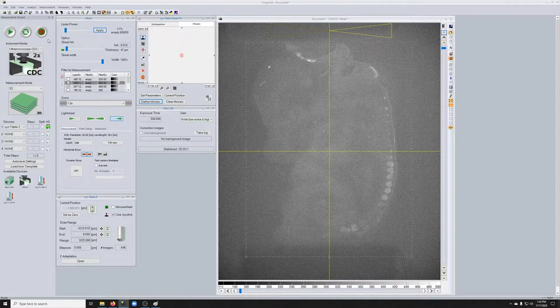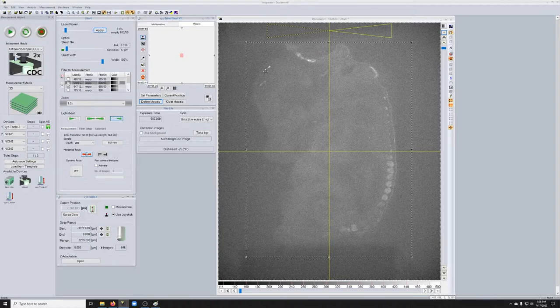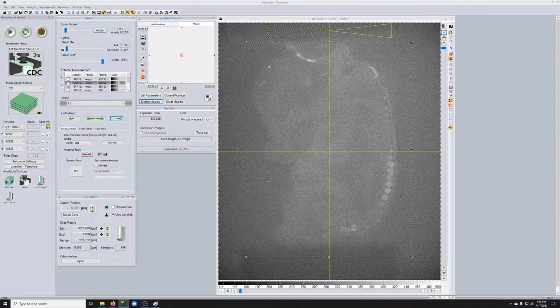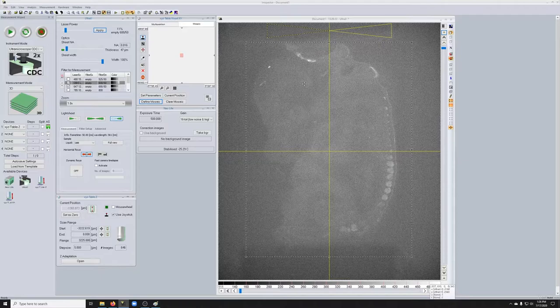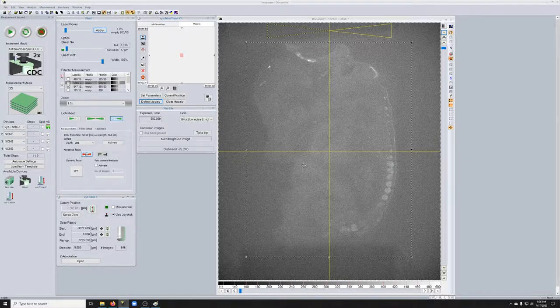Okay, so that concludes what I wanted to tell you about for cropping. It's really a very useful tool if your sample doesn't fill the whole field of view, or if you need to do tiling, which is what we'll talk about next.